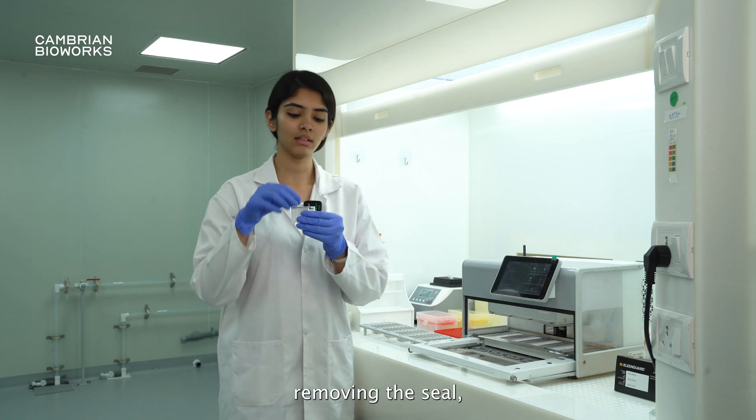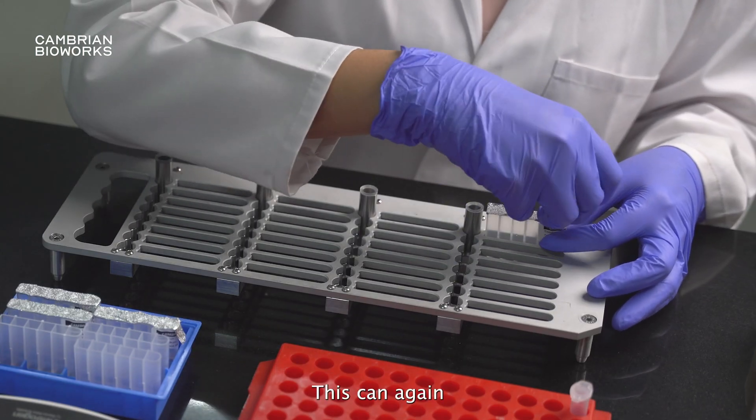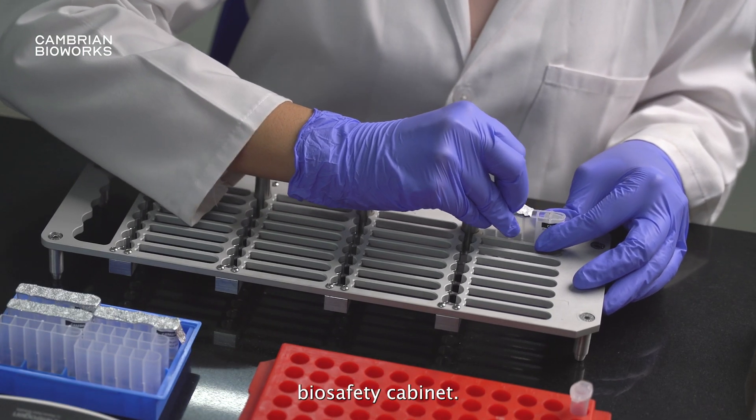While you are removing the seal, you have to ensure that you do it gently, like so. This can again be done inside of the biosafety cabinet.